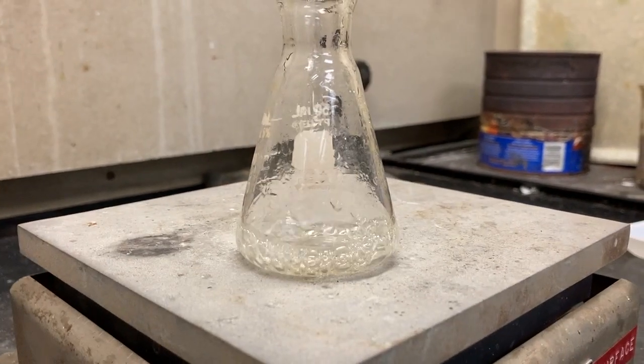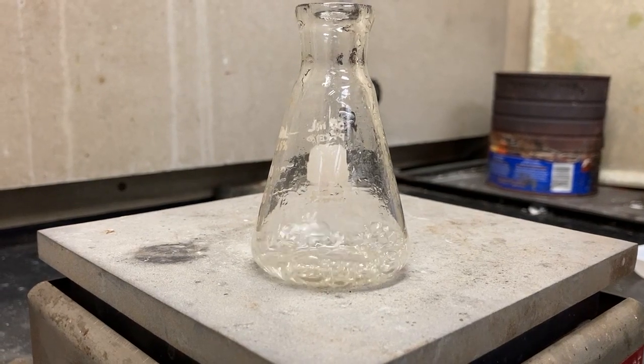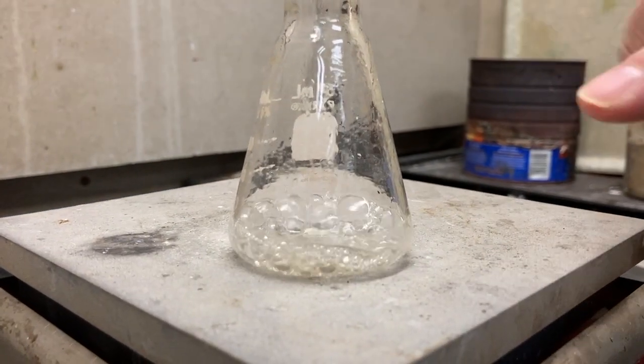Well, the solution is reducing, so there's less total volume of liquid. Most of the water's evaporated out. Pretty soon, we're going to start to see the solid dry up.